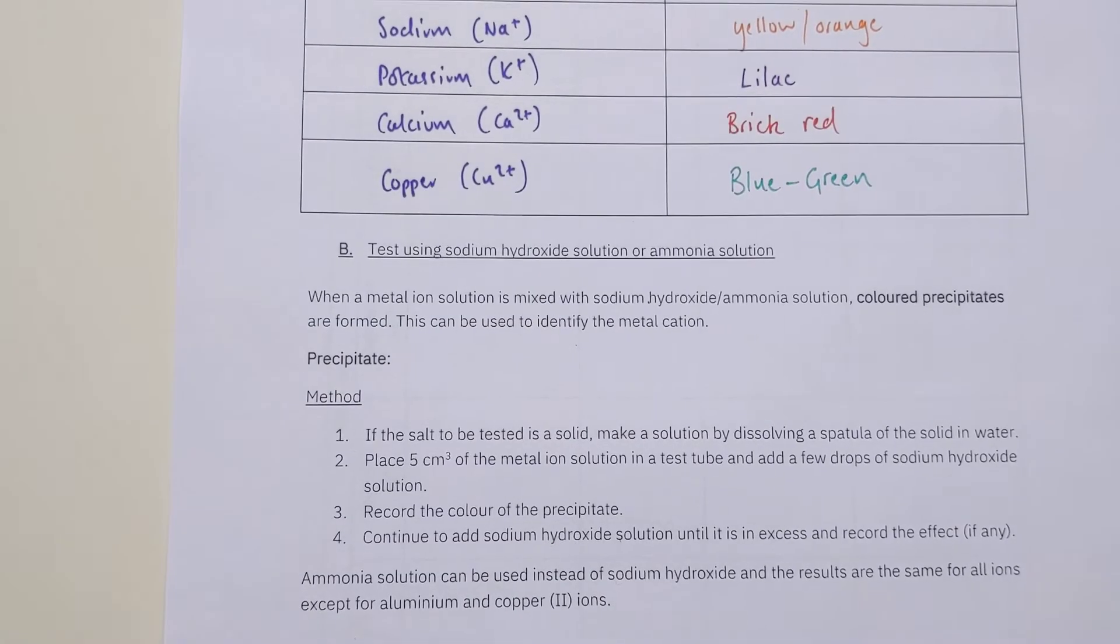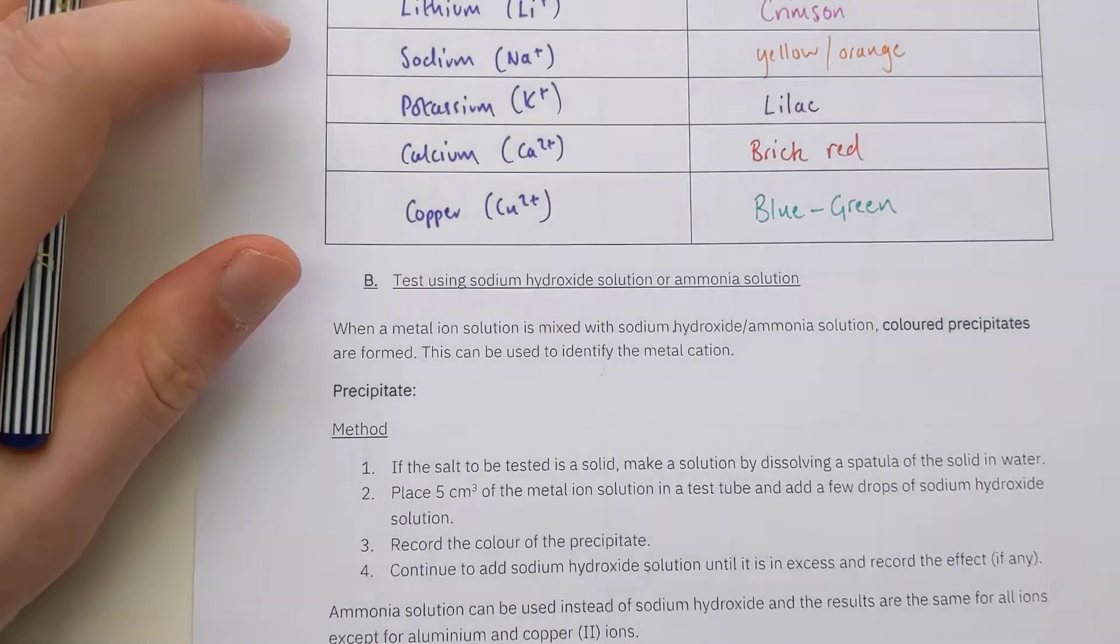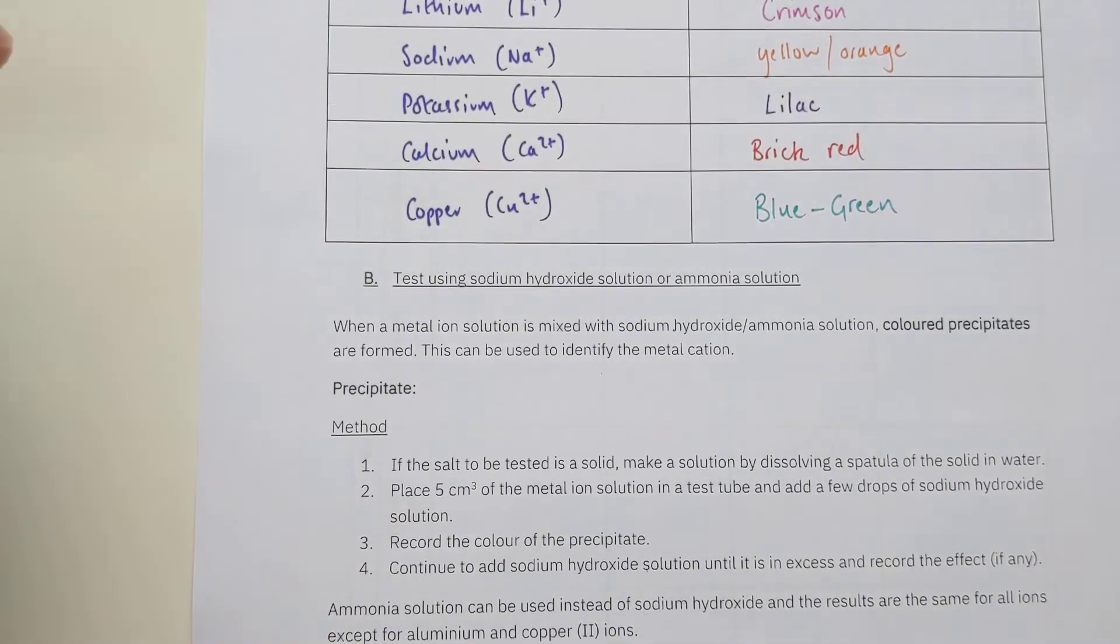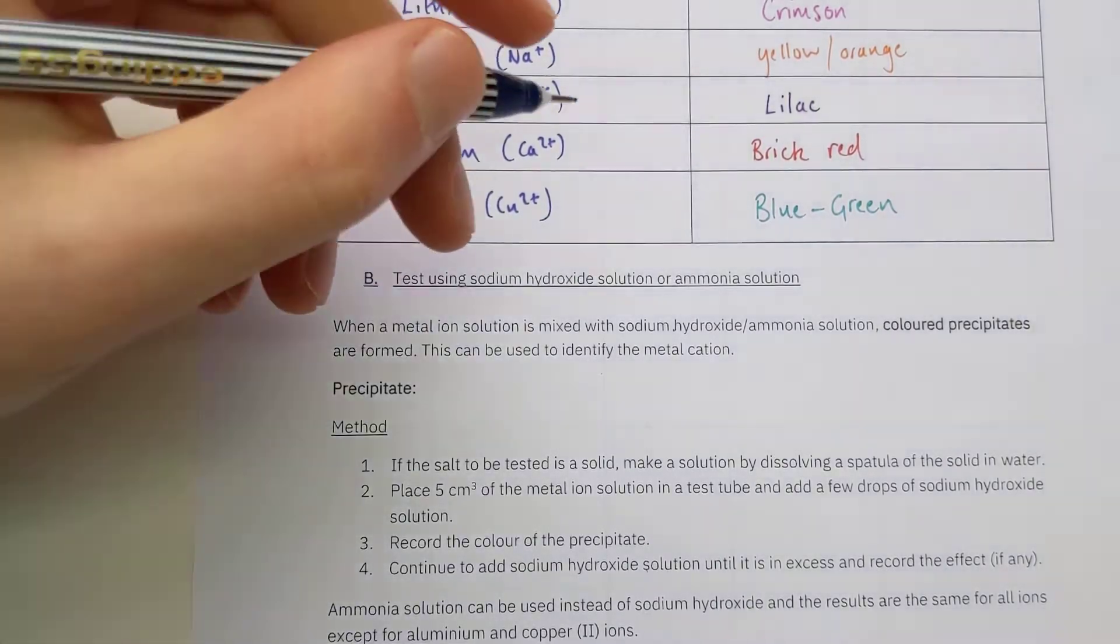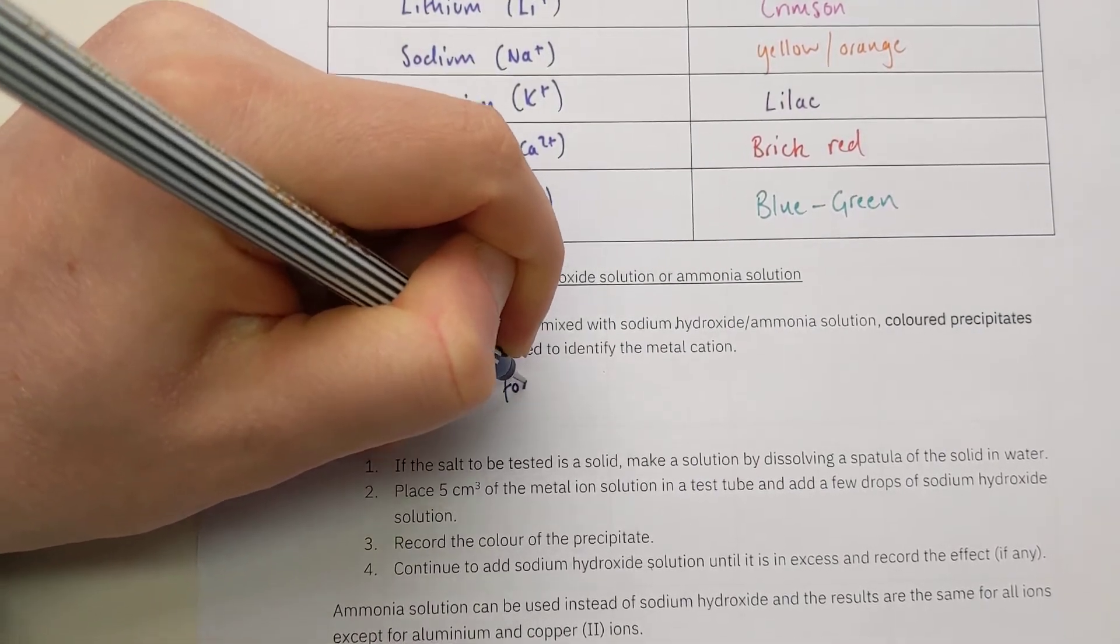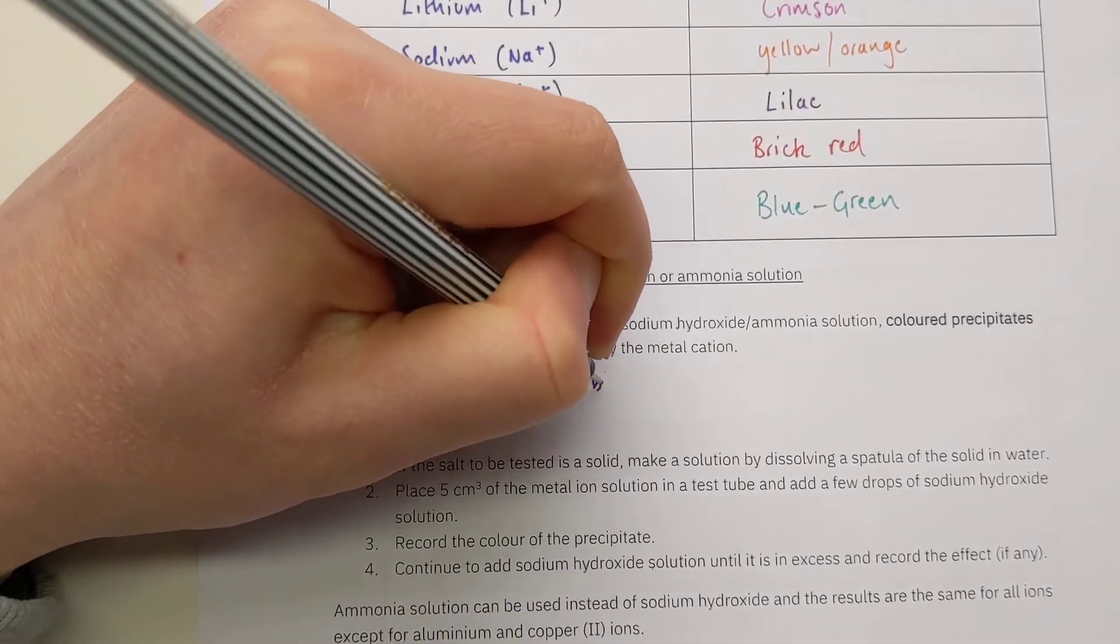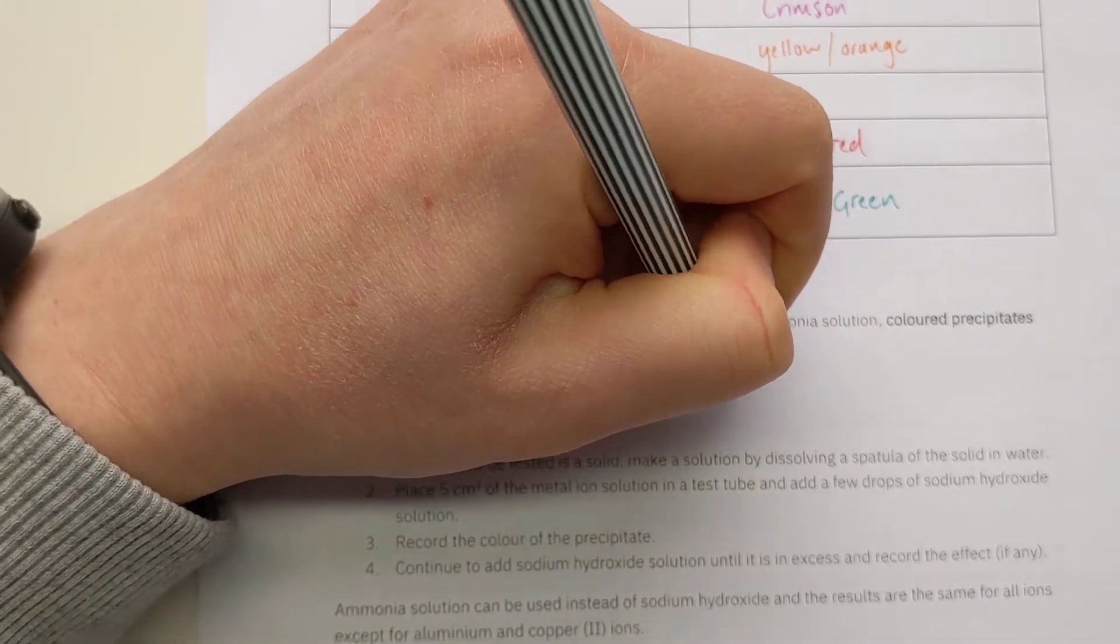How this test works is for different metal ions or cations, I'll get different types of precipitate, different colors or different behavior precipitates depending on the ion. I can tell them apart from each other and work out what the metal was in the first place. When a metal ion solution is mixed with sodium hydroxide or ammonia, colored precipitates are formed. A precipitate is a solid formed by mixing two solutions.